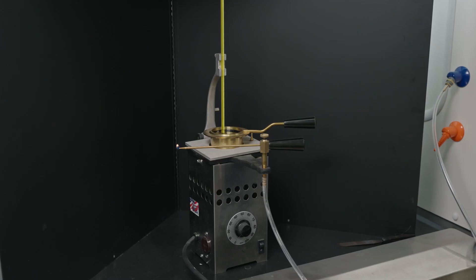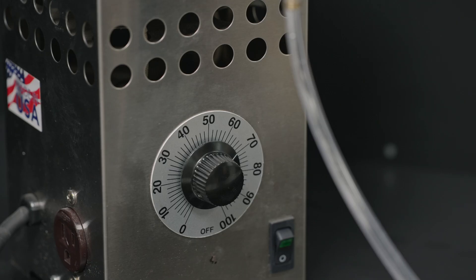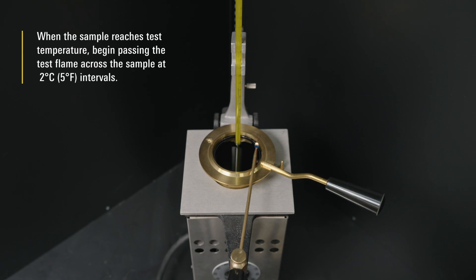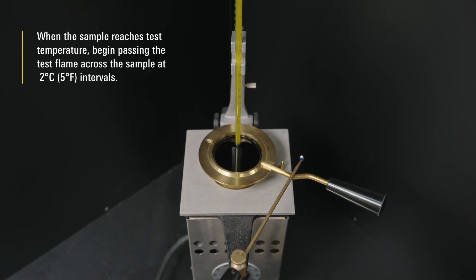Heat the sample at the rate specified in the test procedure. When the sample reaches test temperature, begin passing the test flame across the sample at 2 ºC intervals.